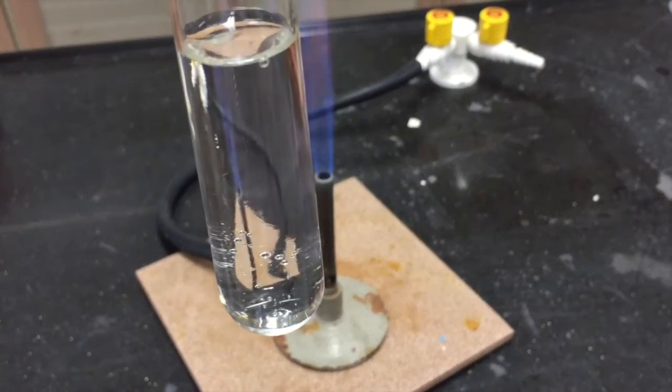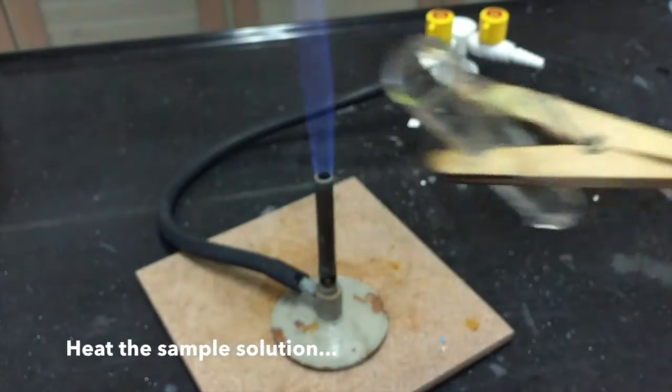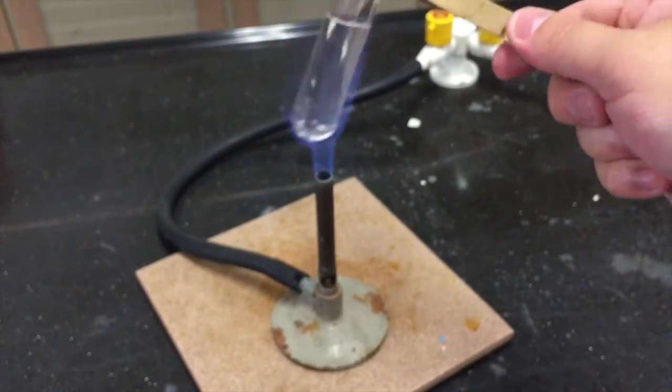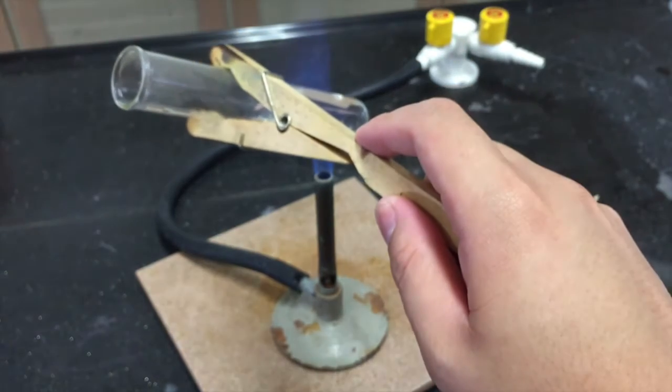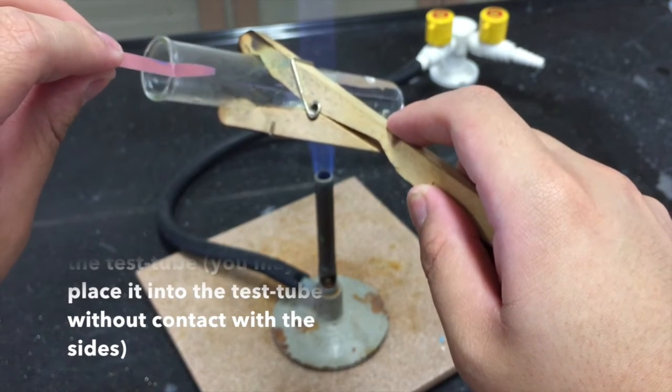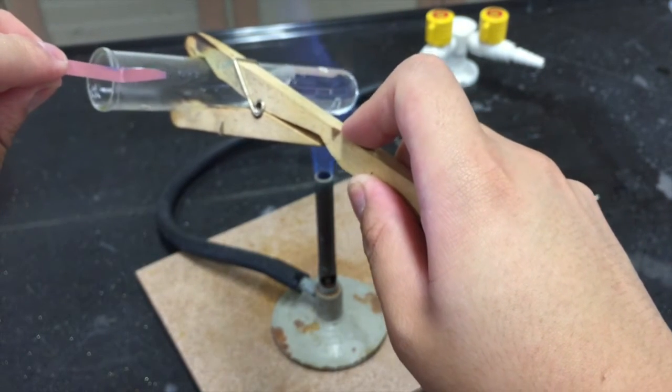As soon as you have added the sodium hydroxide solution, heat the solution sample. As you heat the solution sample over the Bunsen flame, immediately hold the moist red litmus paper over the mouth of the test tube.